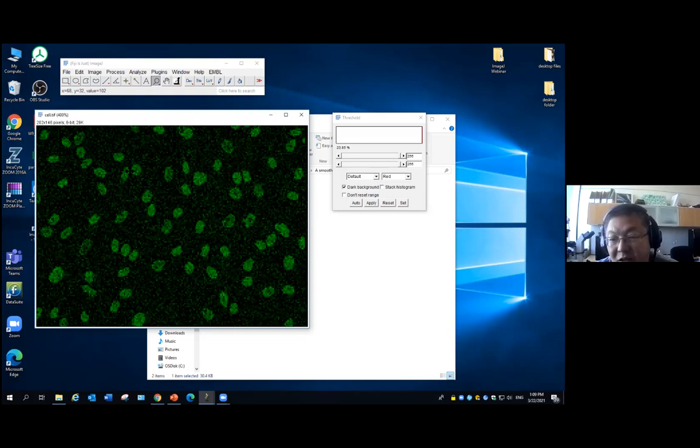We can do something in the digital image analysis step once we already have the image. But all we did here is use the smooth filters. We'll just do it in a second. It has some disadvantage to it. We sacrifice something. So the best way to solve your digital image analysis problem is always to get the best raw image you can. Then you begin to do your analysis. It saves a lot of time.